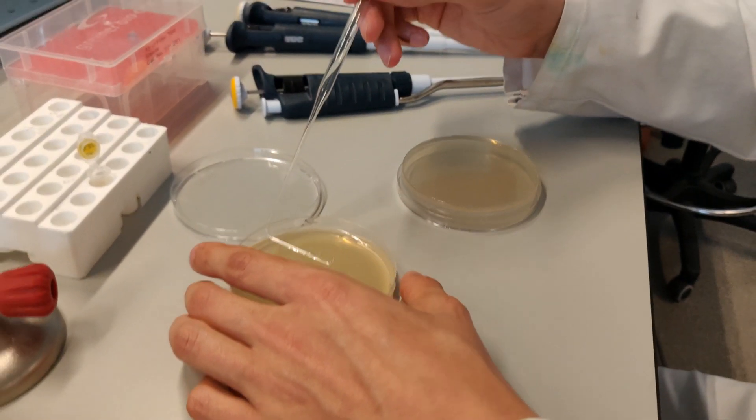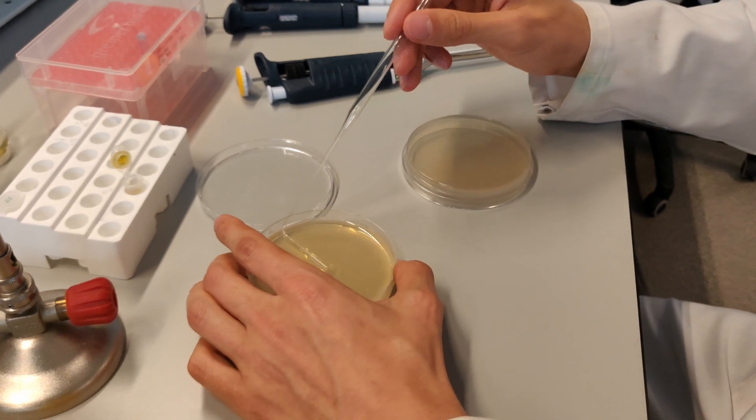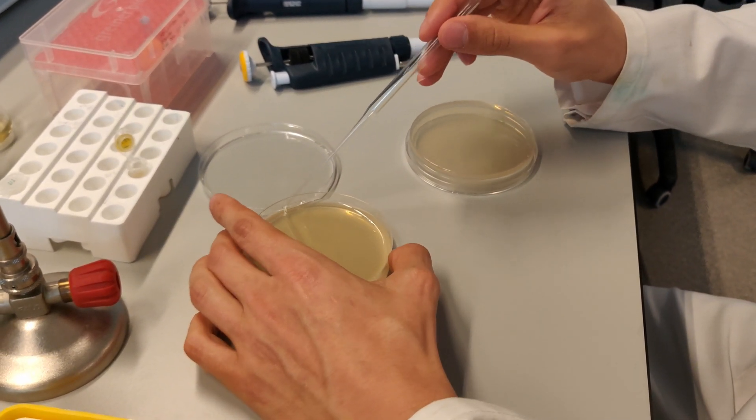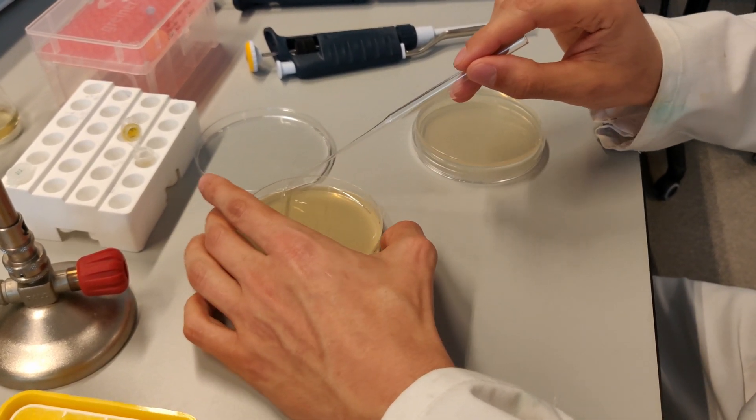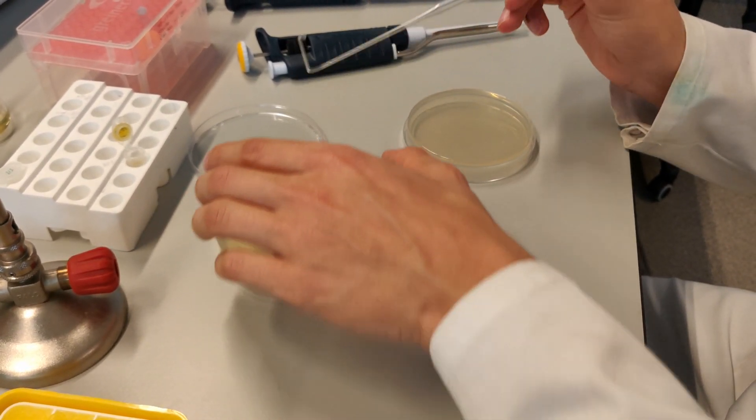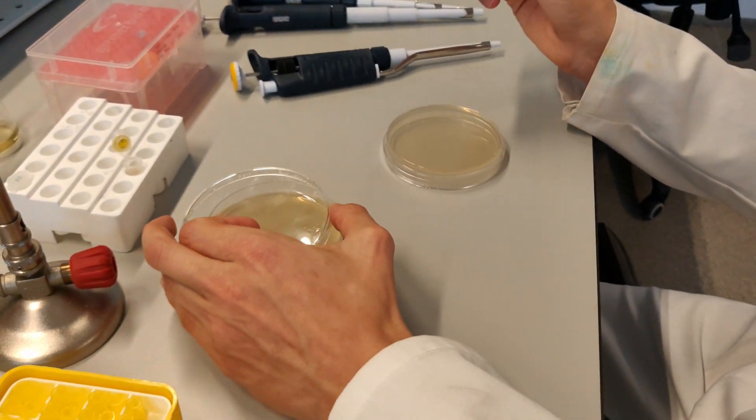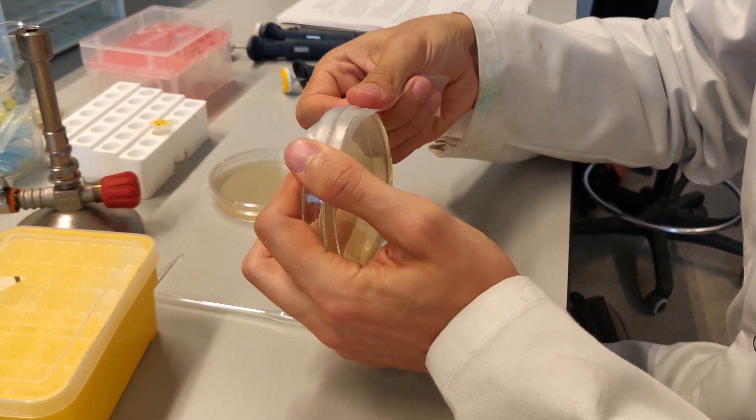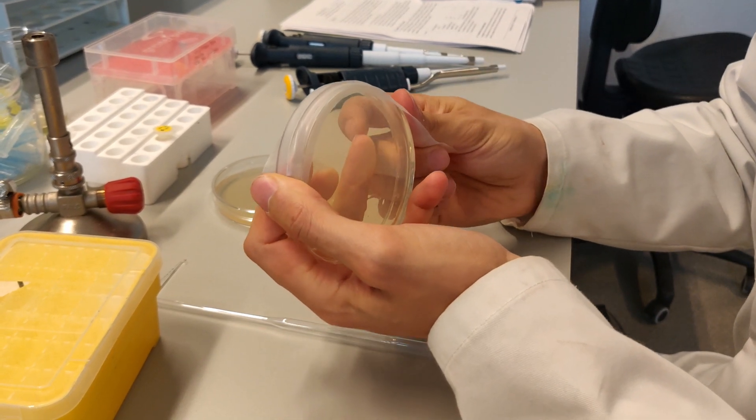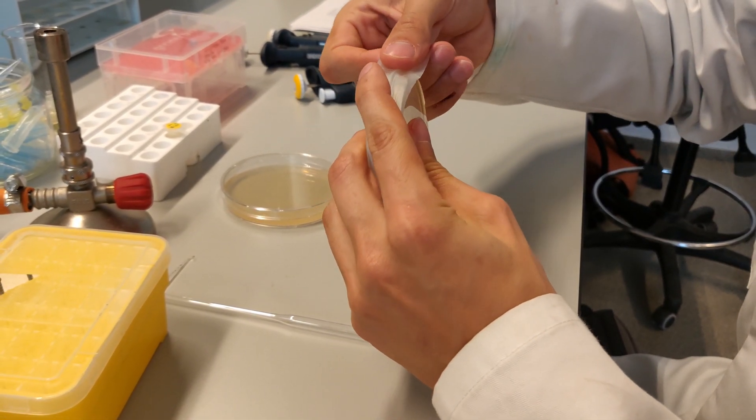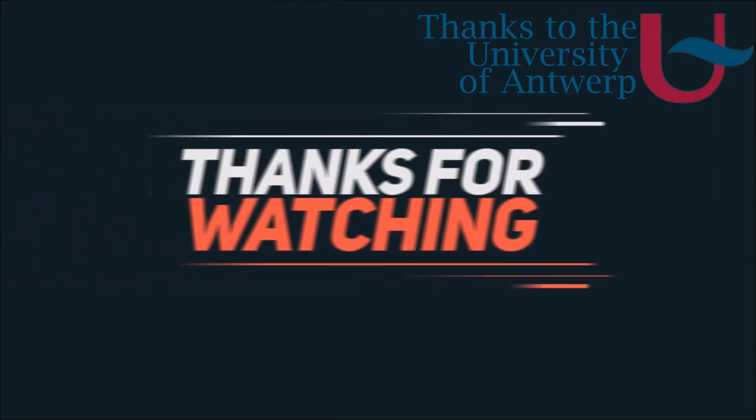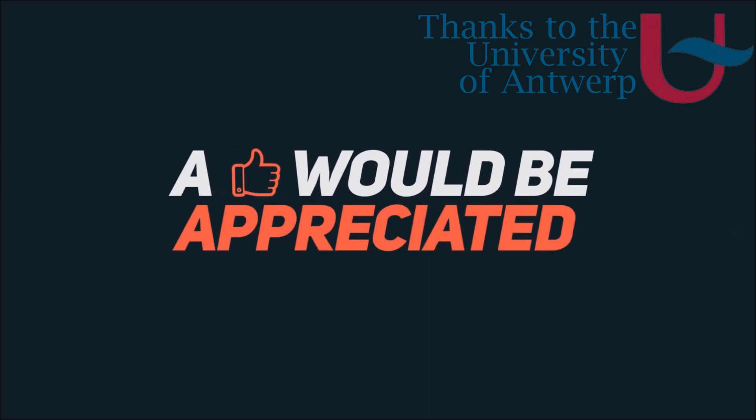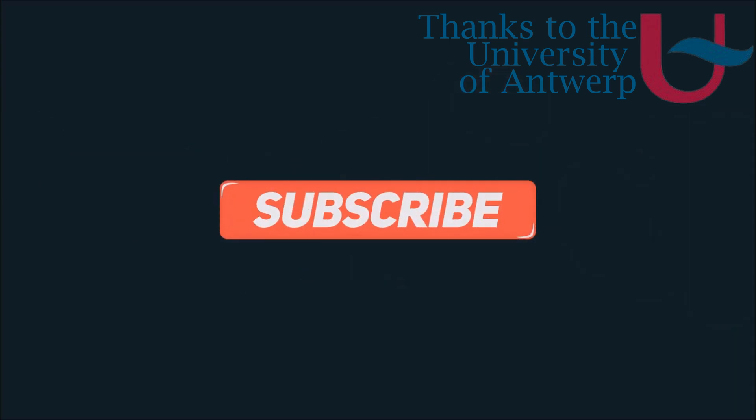Finally incubate overnight at 37 degrees and normally colonies that can express the yellow fluorescent protein will now grow. Thank you for joining us.